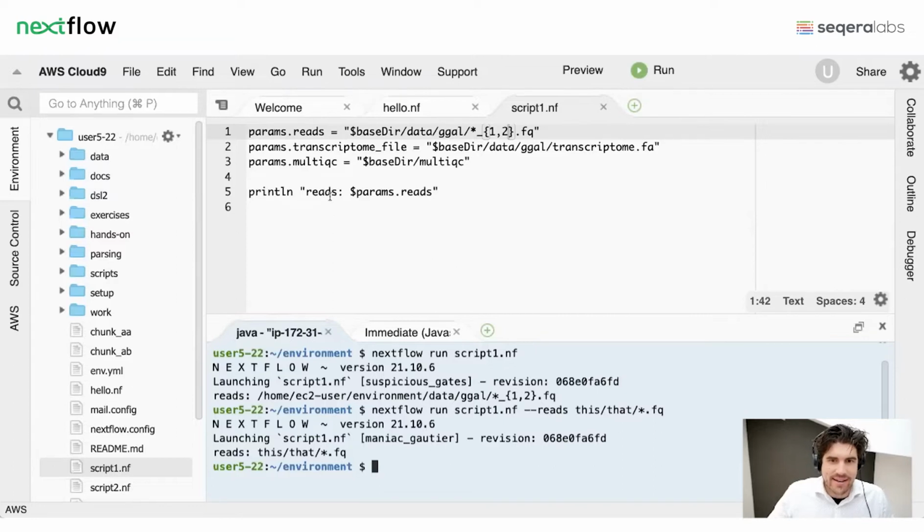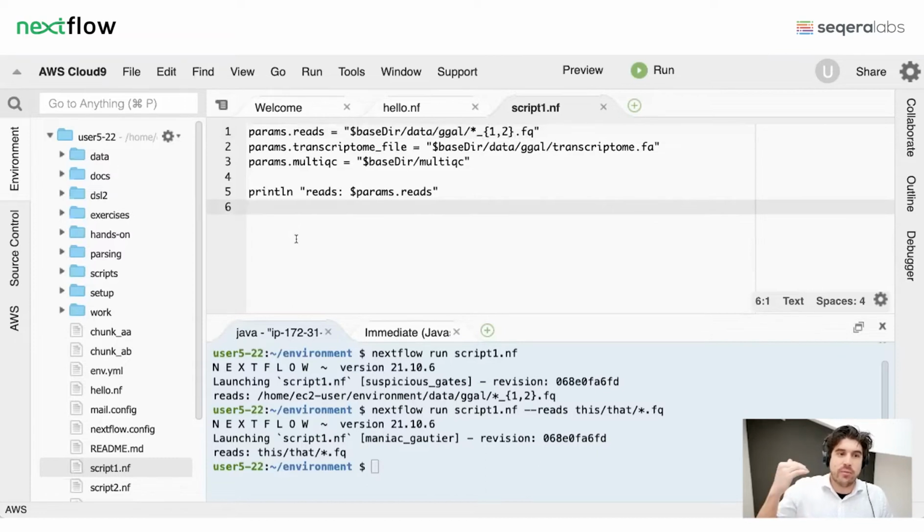And then I want you to add a 4th parameter, a different parameter. The 4th parameter is a location that we're going to save some results to, basically the output of the pipeline. We want to put that in. So I want you to create a new parameter called outdir, and then make it basically just a location somewhere. So just define it there.